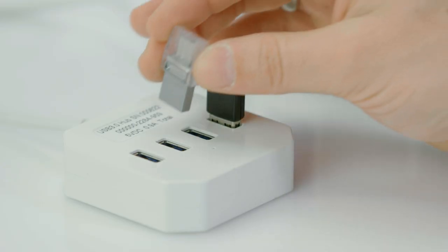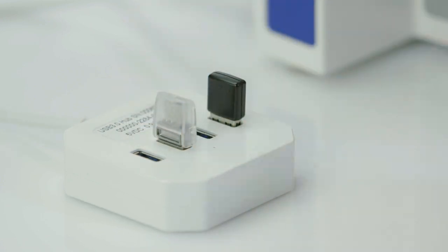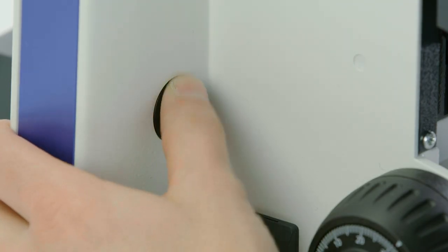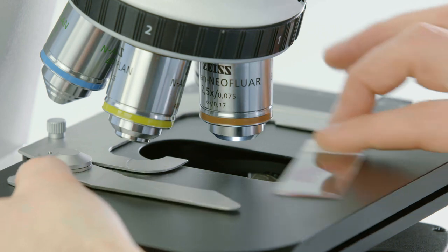Insert a USB stick into your Smart Axioscam 208 microscope camera. Switch on the microscope and place your sample on the stage.